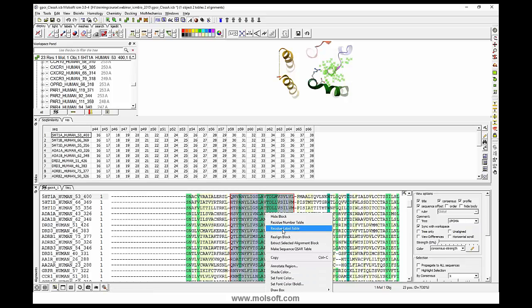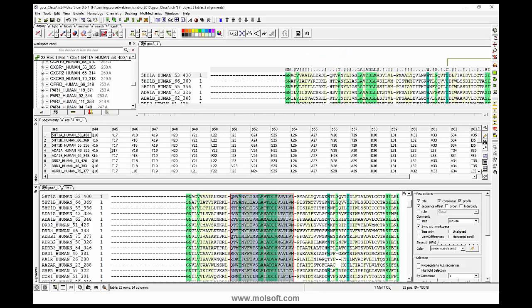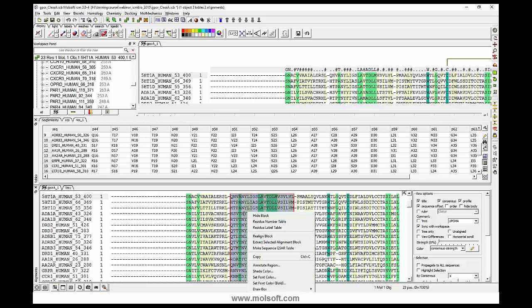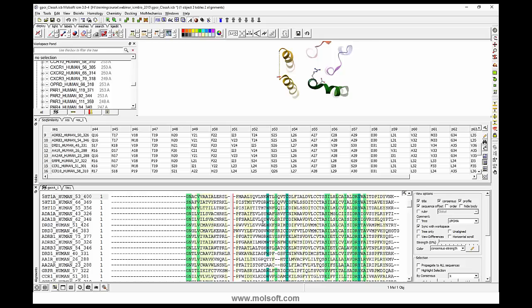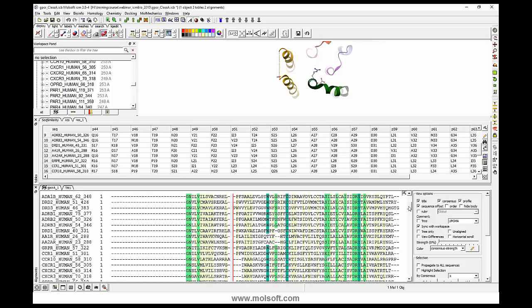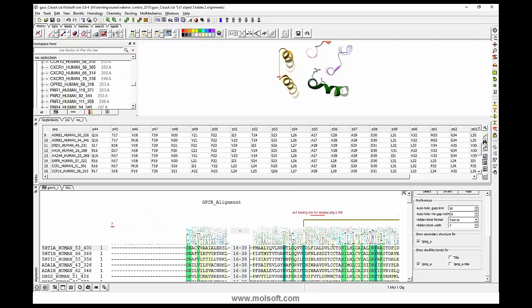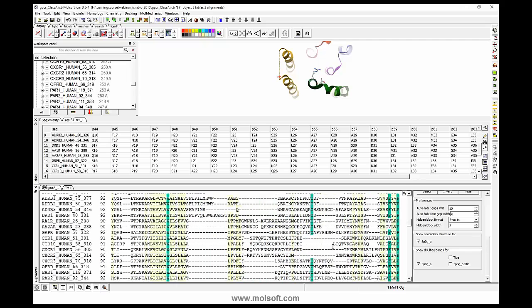You can also do it with the labels as well, similar to the similarity thing, you have the labeling at each position. And you can copy the alignment and maybe hide that region if you're not interested in seeing it, and change that. Okay.